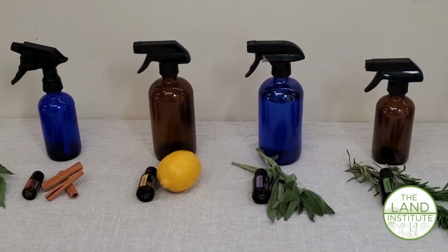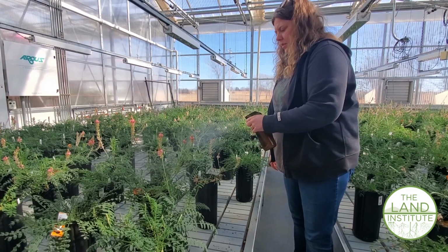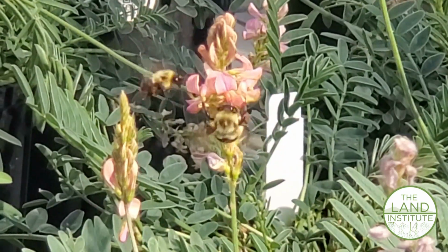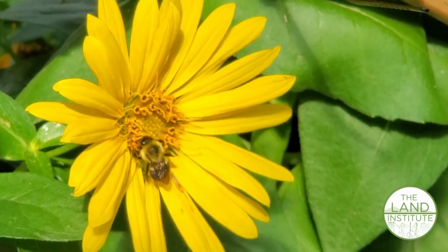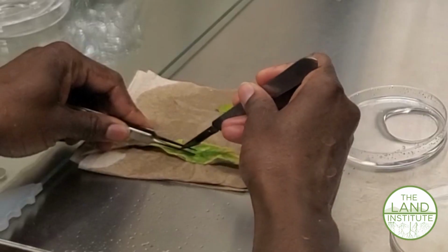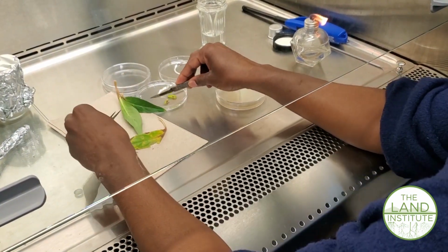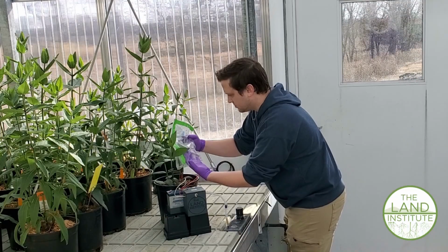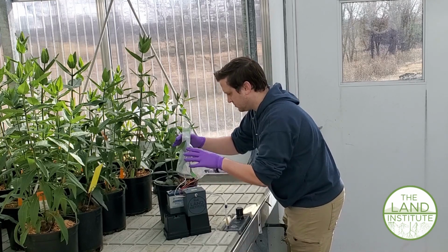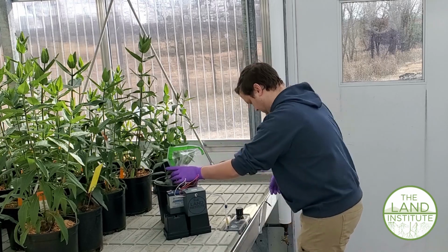At the Land Institute, we seek environmentally friendly methods to manage insects and pathogens in perennial grain crops. Plants have evolved many natural chemicals to defend themselves and to attract pollinators. Identifying these natural chemicals can help us to discover what organic compounds each plant produces. To study these chemicals, we use gas chromatography-coupled mass spectrometry, or GCMS, to quantify their molecular structures.